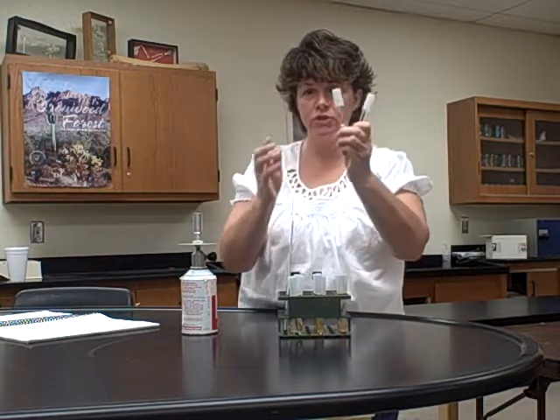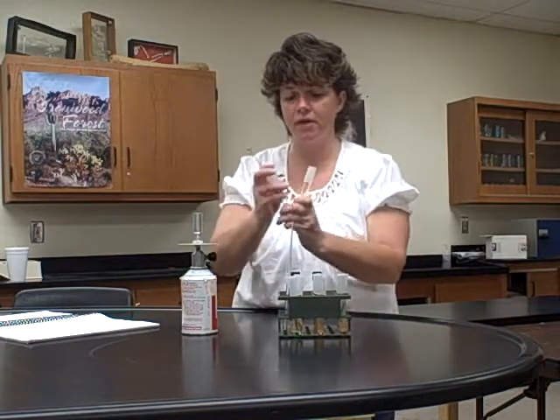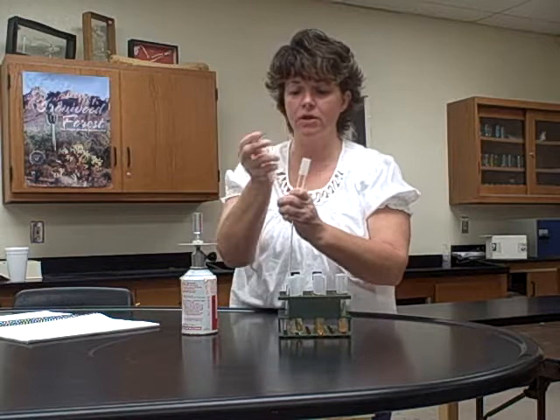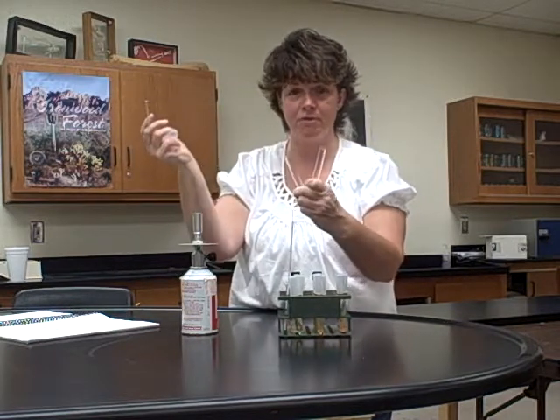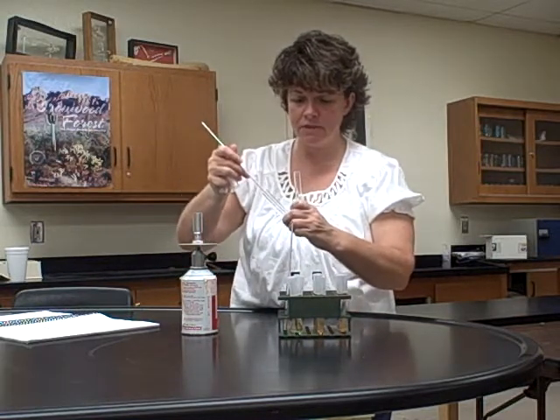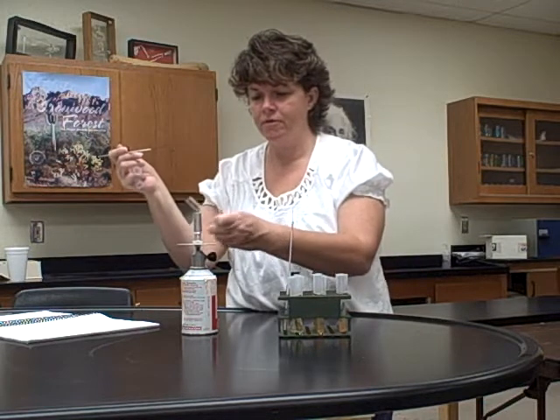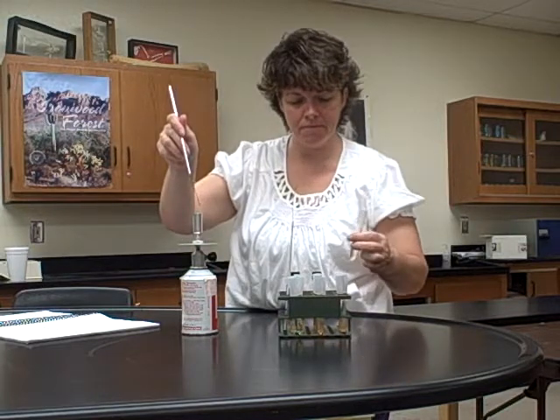Now, I want you to hold both tubes in one hand, okay? I don't want one tube here and one there; I want you to get used to holding 2 tubes in one hand, okay? After I've sterilized my loop and I'm ready to transfer from here to here, I'm going to use my fingers again, okay? This time I'm using 2 fingers. I pull off both of them, flame both of them, and then I'm going to dip into the culture and then go directly into the broth, and you can kind of shake it a little bit. Then I would flame my tubes again, put their lids back on, and flame my loop.